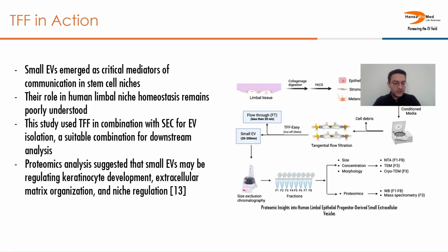Since this combination is a gentle approach, on the contrary to ultracentrifugation, this approach allows downstream analysis, namely proteomics analysis, which suggests to the researchers that small EVs may be regulating keratinocyte development, extracellular matrix organization, and regulation in human limbal niche homeostasis.